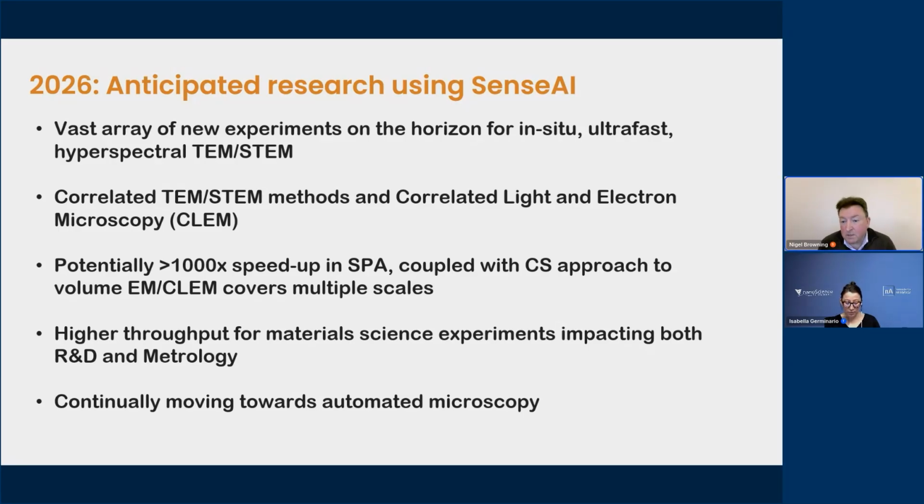For material science, for the experiments that we do, obviously there's a lot of work that goes into getting a single image to come out, whether it's worrying about beam damage, whether it's worrying about complex systems, looking at interfaces and defects. In a lot of cases, the amount of time to get an image is very difficult, particularly if you're going to try and use 4D STEM. And the reason it's a lot of difficulty or time consuming is because you don't have a live reconstruction of your 4D STEM data or your map that you're going through, and you have to do that post-processing.